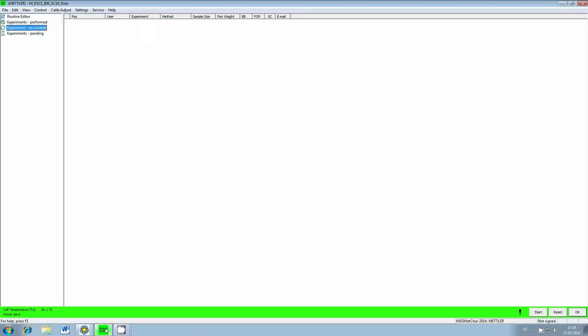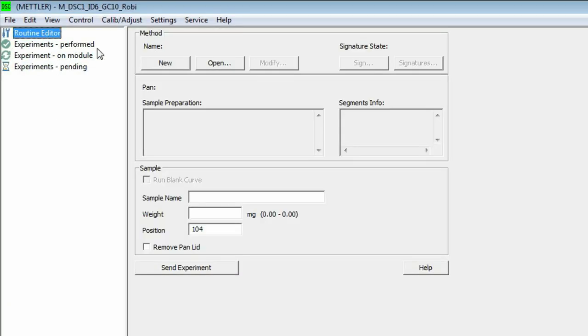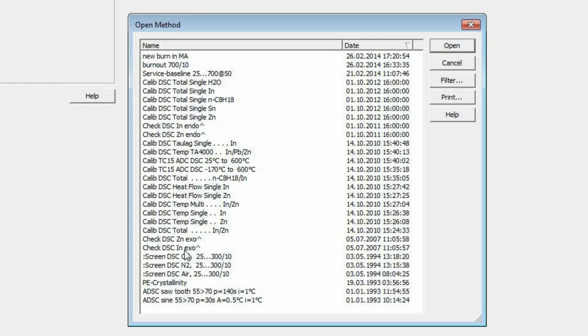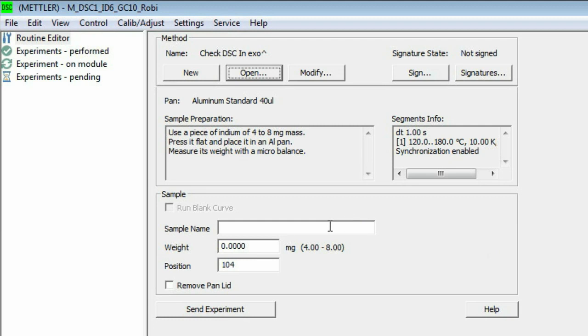In the module window, go to the routine editor. Open the method check DSC indium exo up. Enter the sample name.